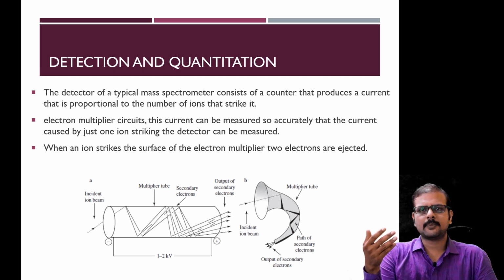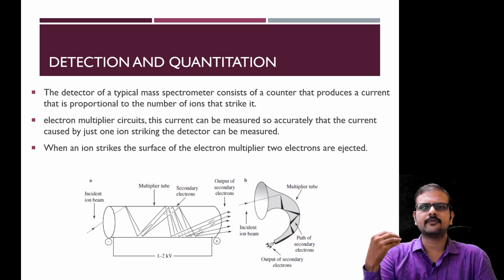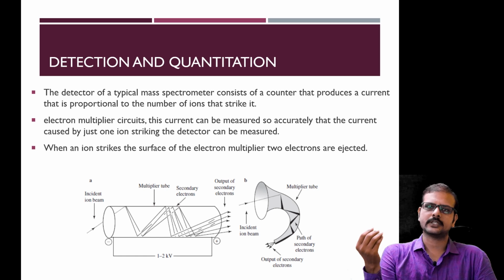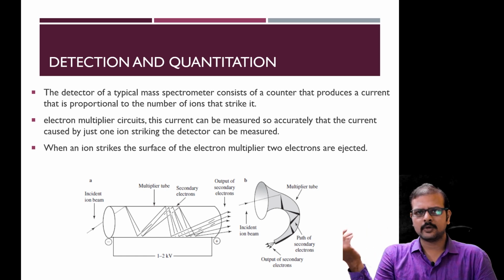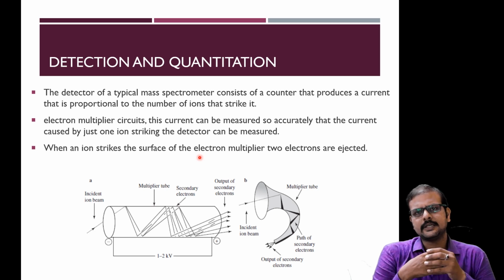The remaining 25 molecules will reach the detector. So only 25% or 10 to 15% of molecules will reach the detector. So out of 100 we reach only 15 ions in the mass detector.